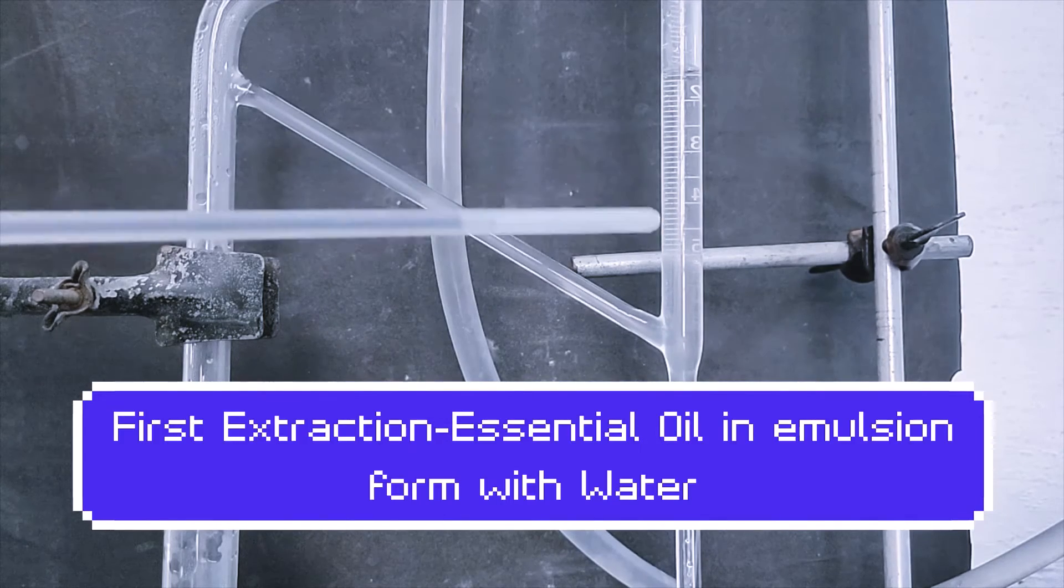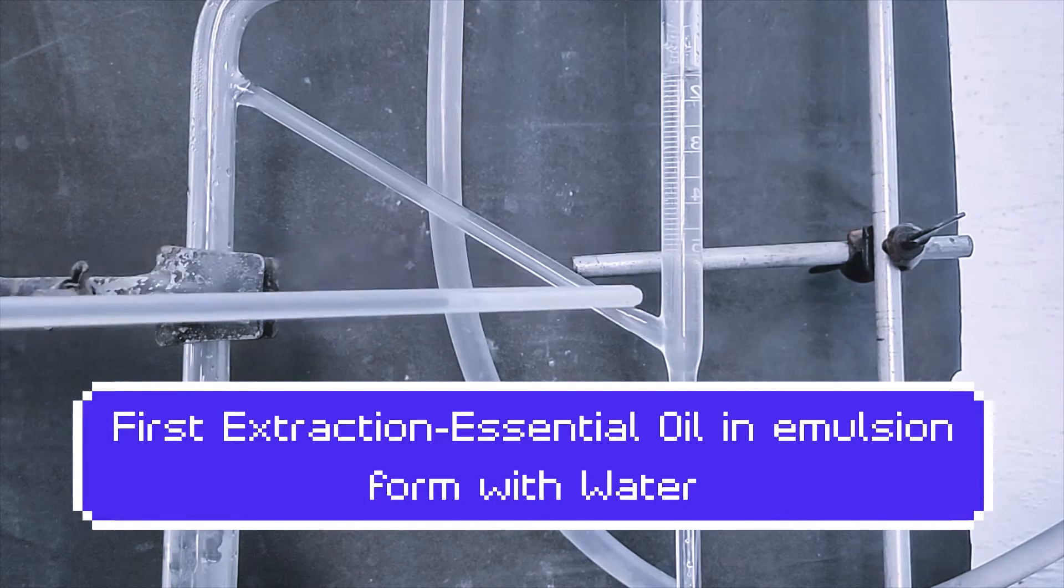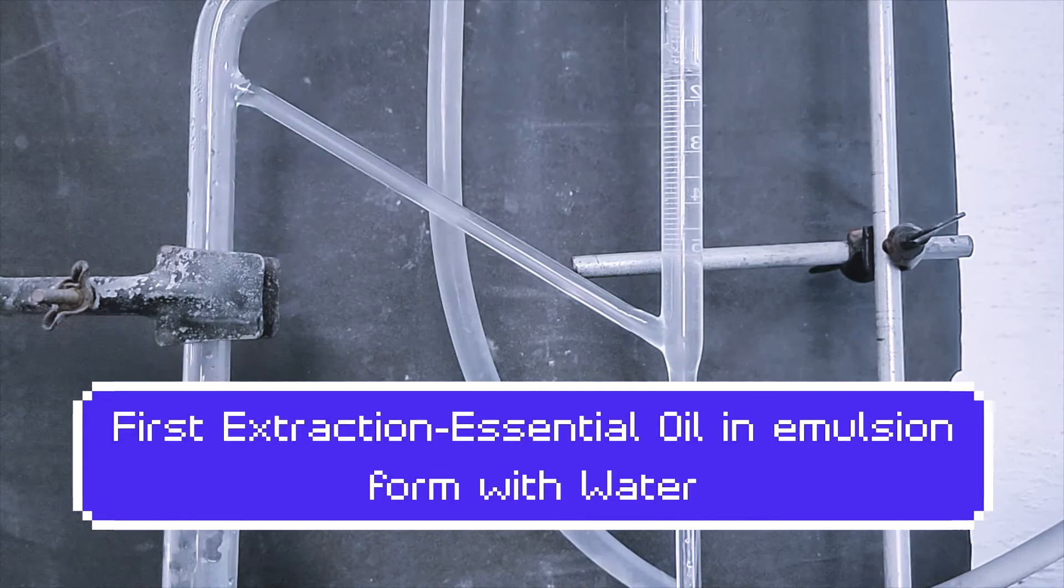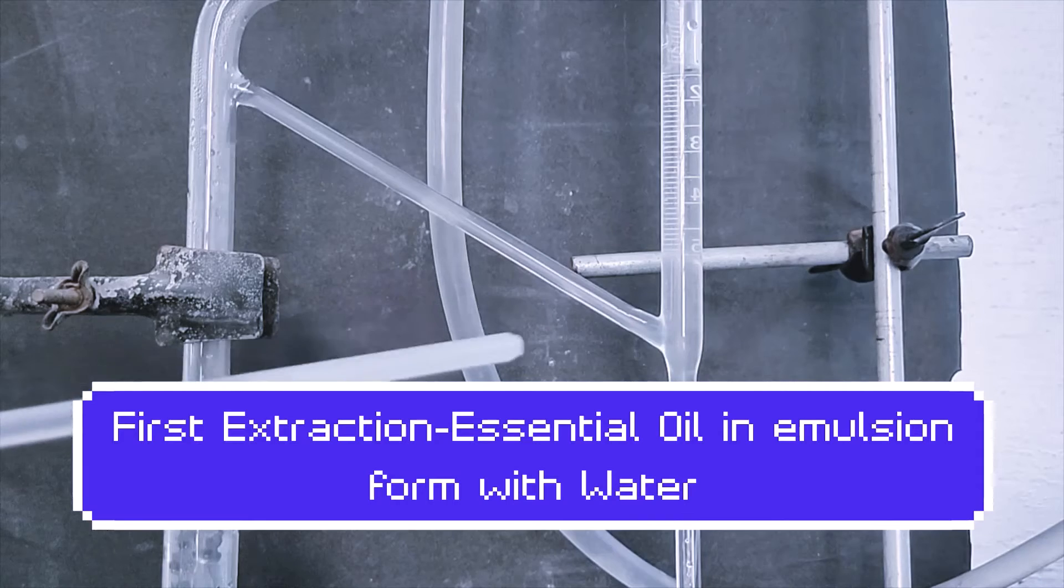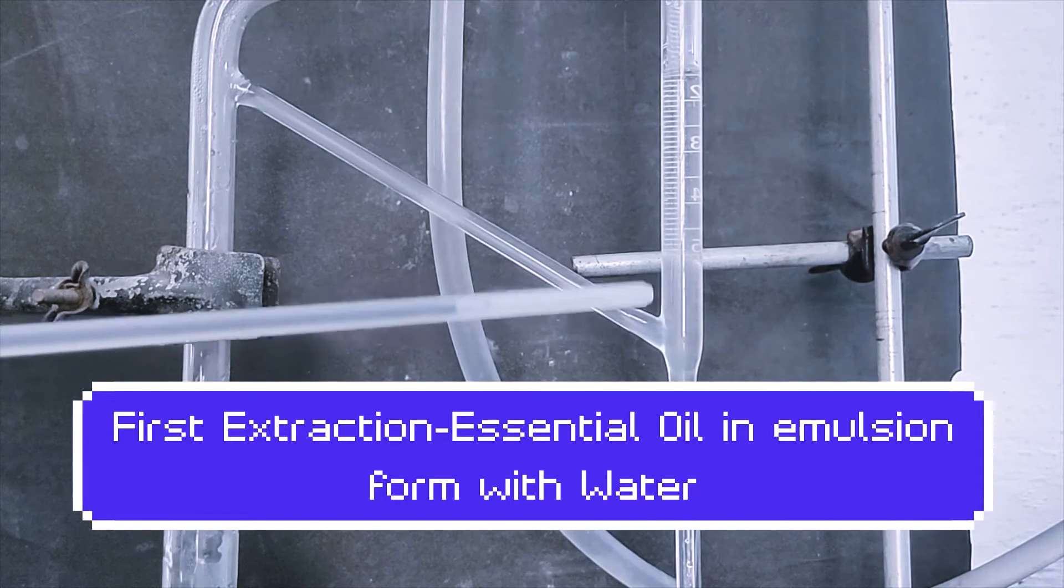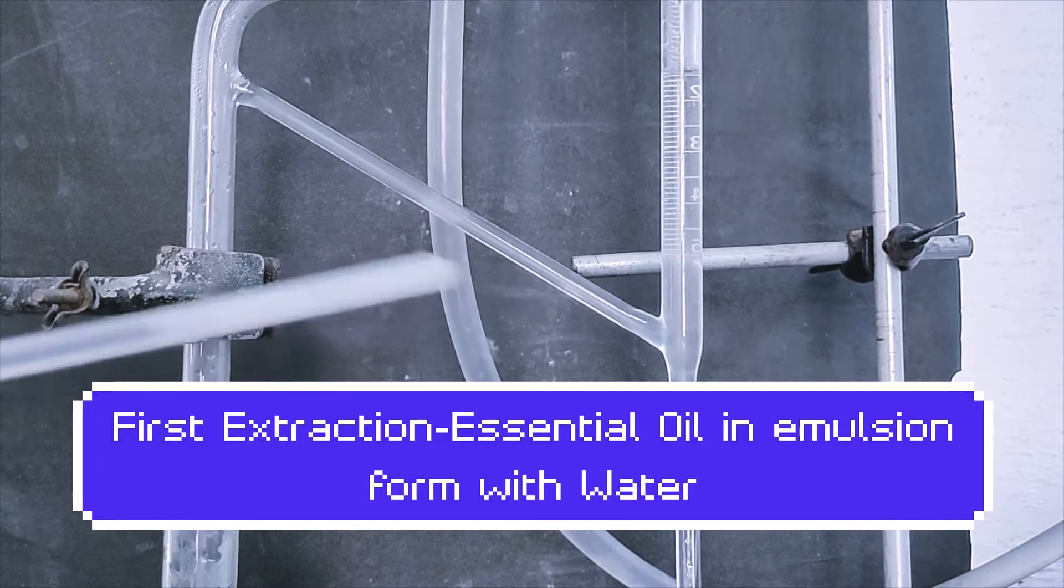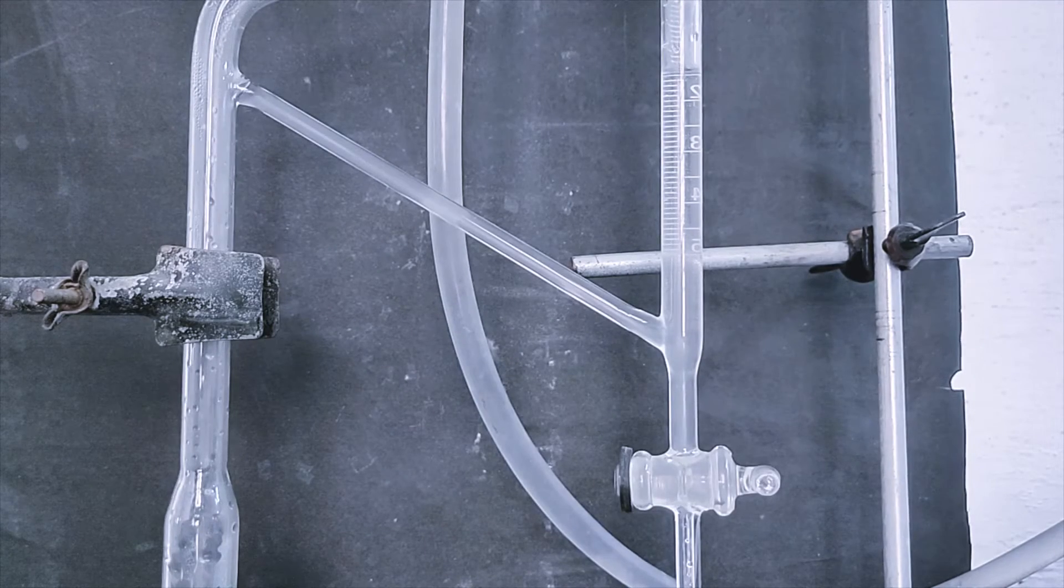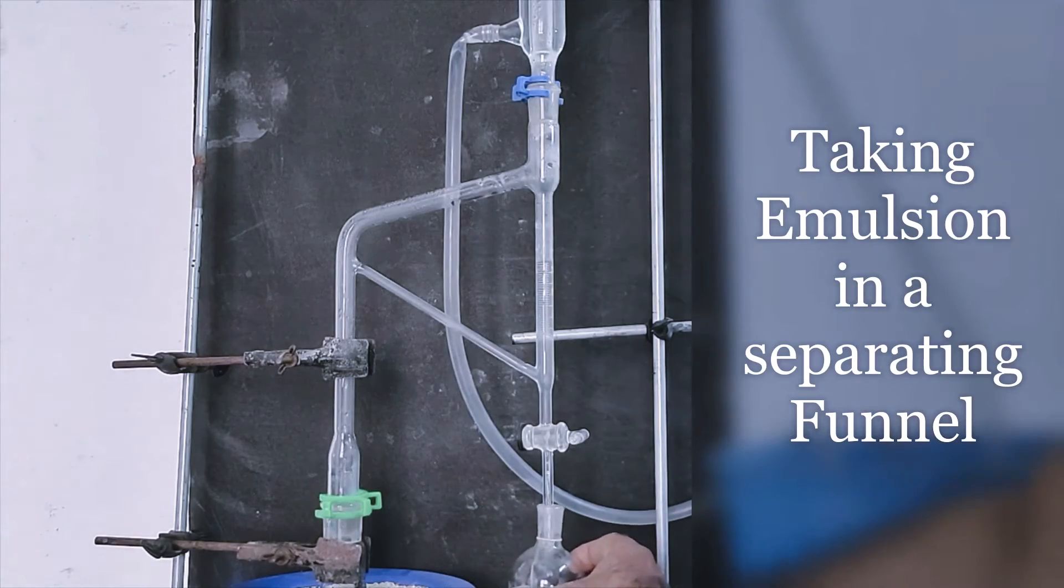Now with the help of the separating funnel, I can separate essential oil from water. I should remove this lower part having more essential oil. Add it into separating funnel.